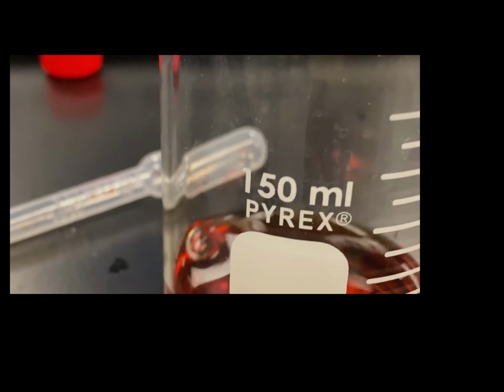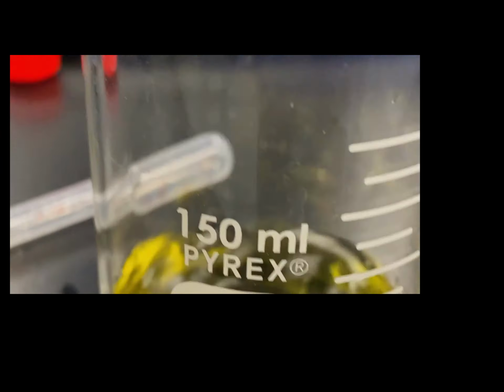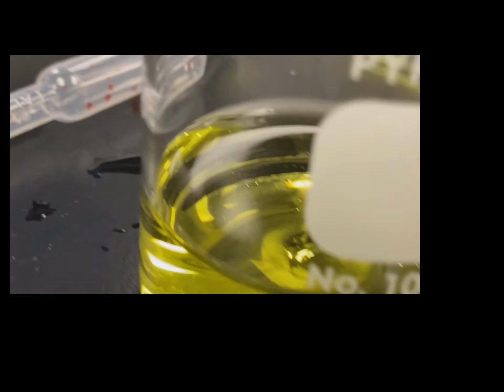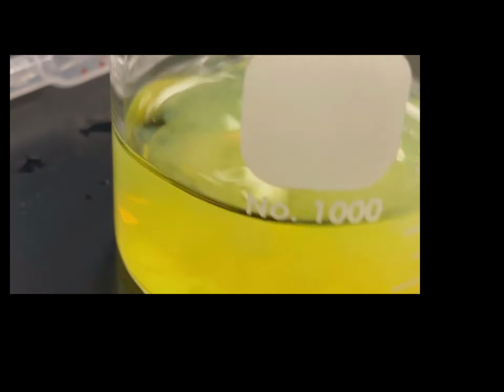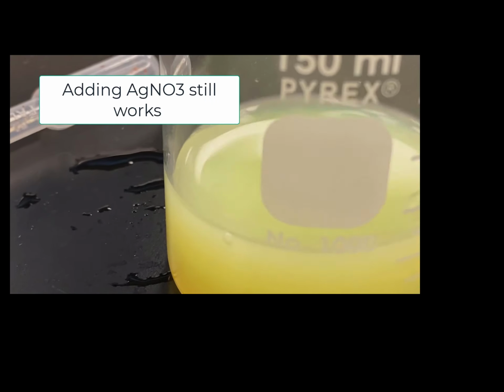So depending entirely on the age of that stuff, how much it's been exposed to acid, what other buffers are in it, it can take away from that color. The great thing is the silver didn't affect it at all. I could add the silver, it still turns white, still precipitates in the same amount of time. So there's no interference from the analytical method using silver, there's no difference.